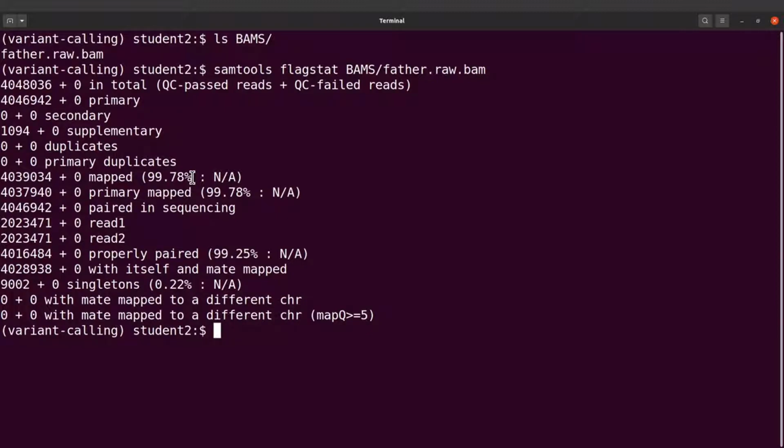If, let's say, you are dealing with human genomes, you perform your read mapping and realize that most of the reads, or quite a substantial number of the reads, are not mapping to the reference sequence, then you should investigate further. That means probably something is wrong. It could be contamination, it could be sequencing error, etc. But you just need to make sure you check that as well. So that's about it. Now let's proceed.